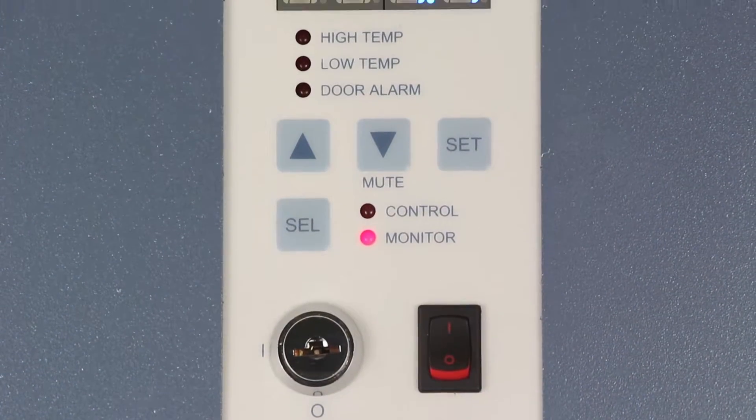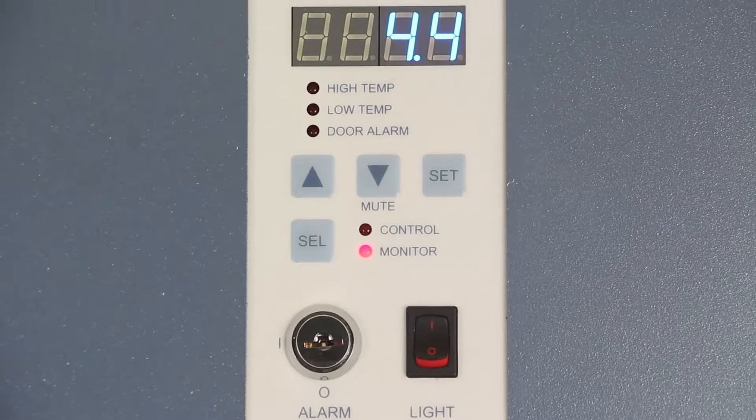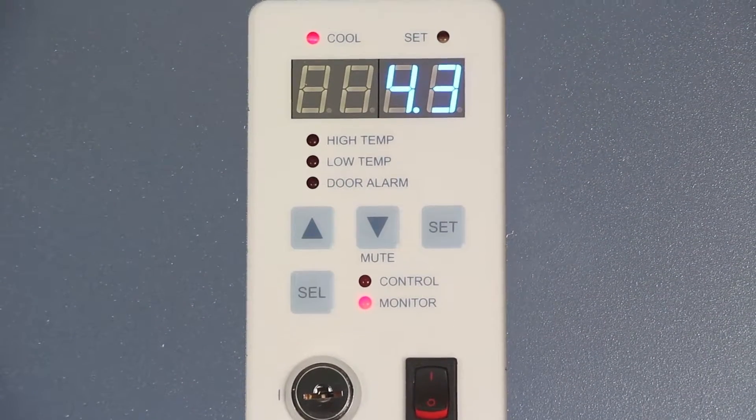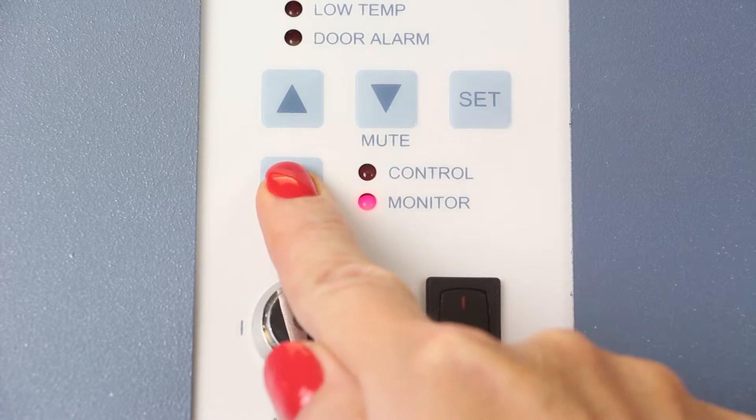Horizon Series refrigerators feature a temperature controller with an LED temperature display. On upright models, the controller is mounted in the top bezel. It provides you with a display of the current temperature and all essential alarm features.